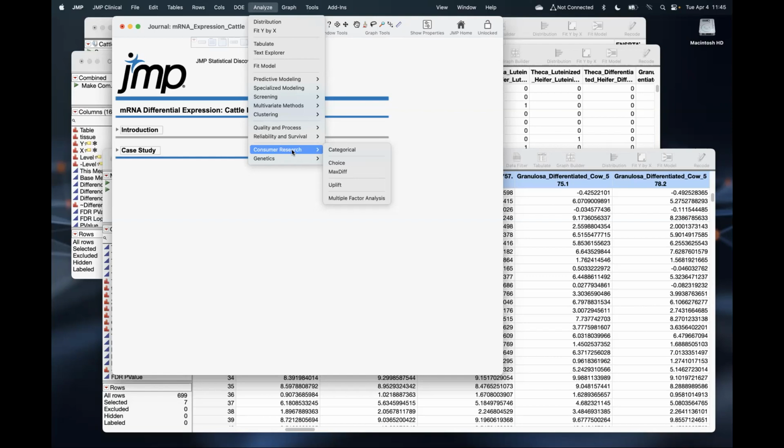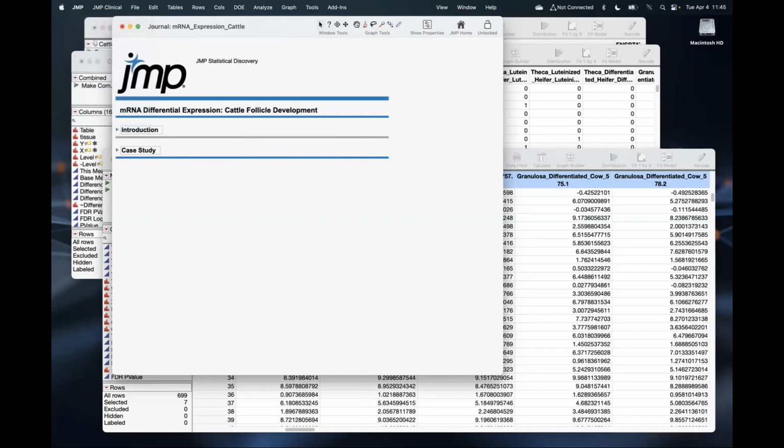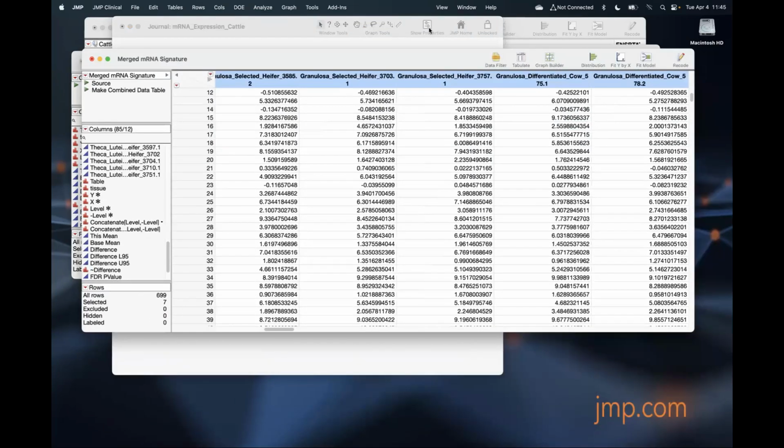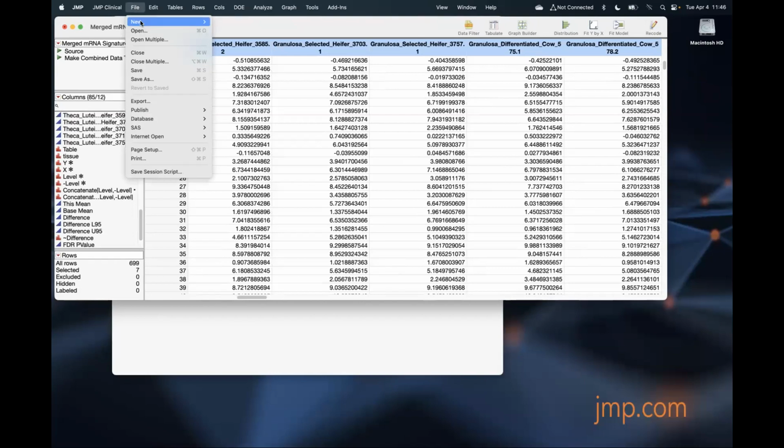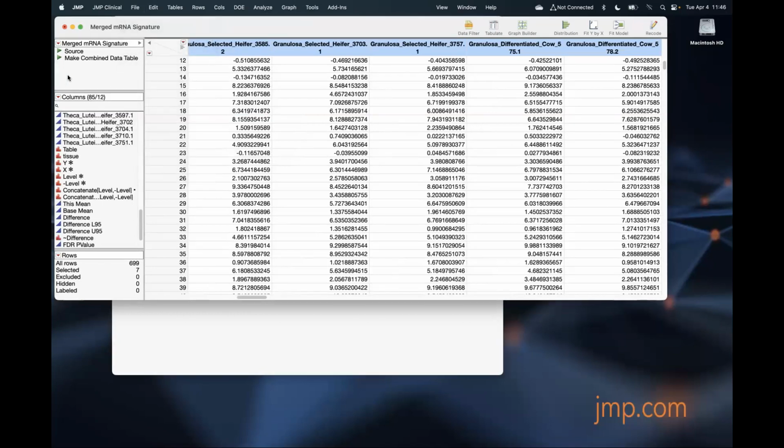Great, thanks. And one other one quickly here, just for clarification, can you upload a database, for example, Silva, to compare your samples to similar microbiome analyses? You can connect to a database, right? But not like a public database. So you'd probably want to download that.